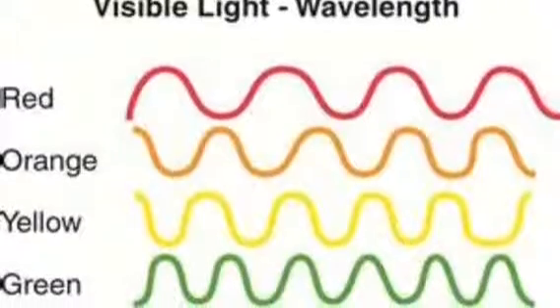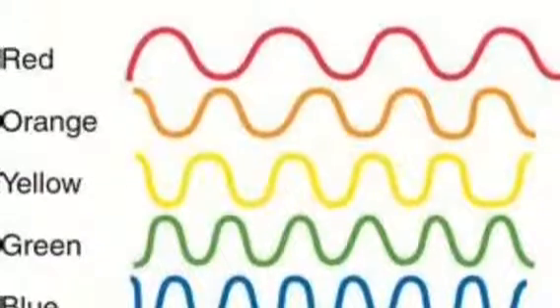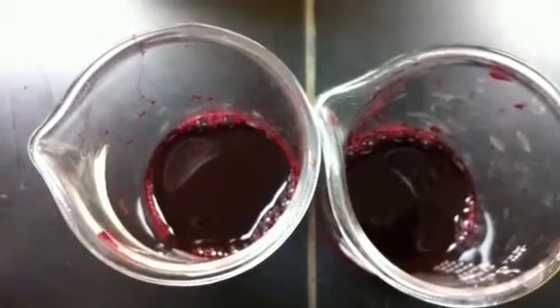We took an interest in studying how pH level affects the wavelength of max absorption of a synthetic versus a natural dye. To conduct such research, we tested the effects of varying pH levels on red 40 dye and beet juice. Both dyes are similar deep red in color, and structurally, they share a similar number of double bonds when comparing the color-producing betalain ion to the red 40 structure. But the red 40 dye has an azo bond, which likely strengthens the red color of the dye more than the natural beet juice.